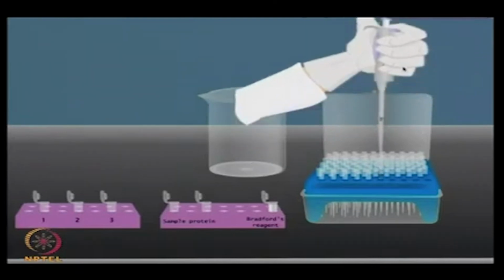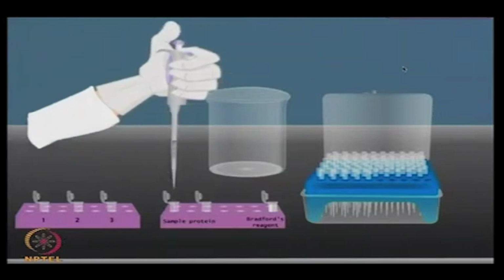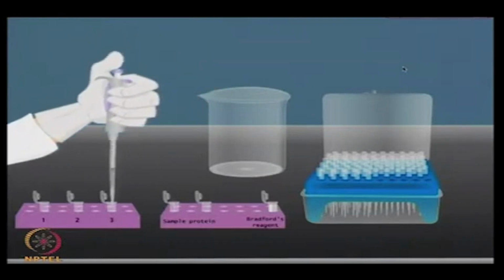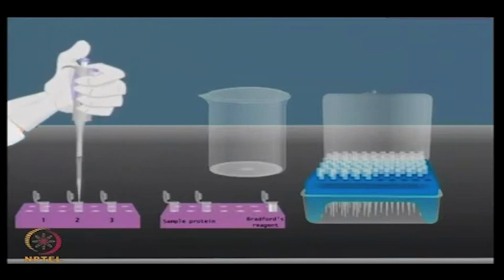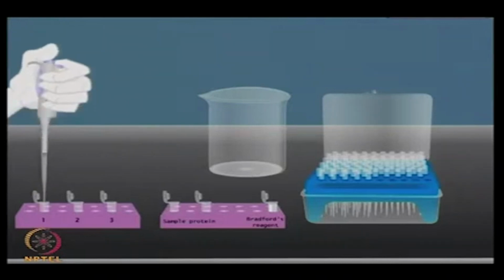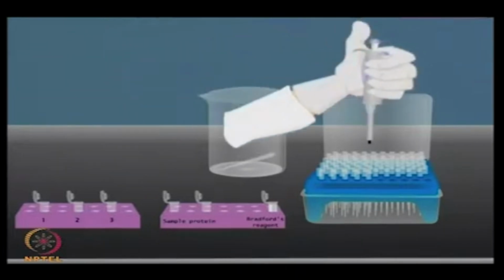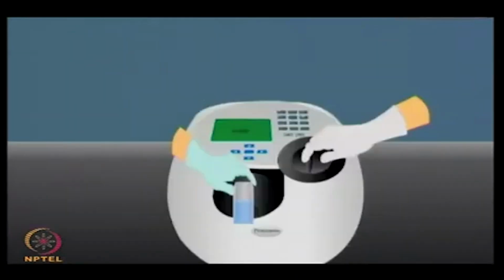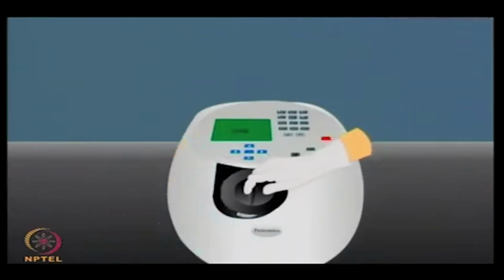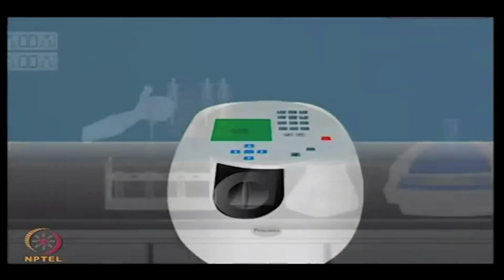So, prepare the Bradford dye reagent and label the tubes suitably for the standard and test samples. Add the standard and sample solutions to their respective tubes. Now, add the Bradford color reagent to the tubes and mix them thoroughly. Once the color reaction has occurred, perform the absorbance measurement at 595 nanometer.